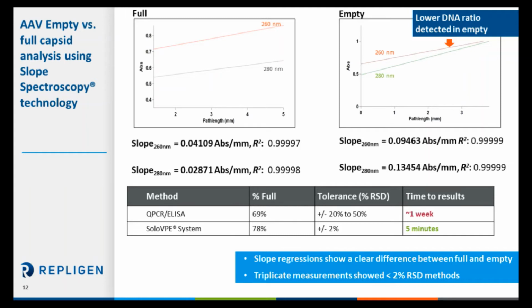So there's a couple of factors that need to go into place here. When we're calculating something like this, we're taking the either known or theoretical extinction coefficient and using that in the calculation. And this is also a bit of a departure for us, where we're looking at quite wide tolerances in the protein world and DNA world. We're used to sub-percent accuracy levels, whereas this can range anywhere from 20% to 50% in some cases.